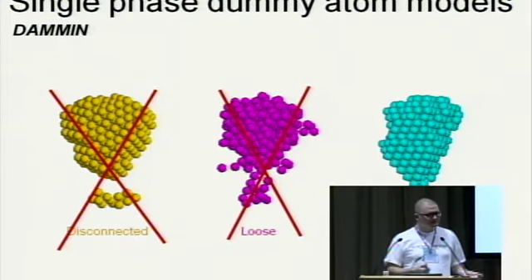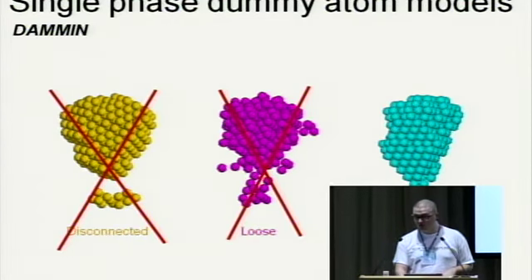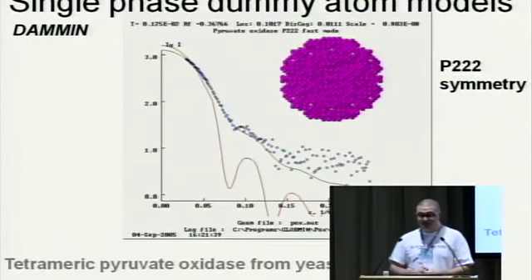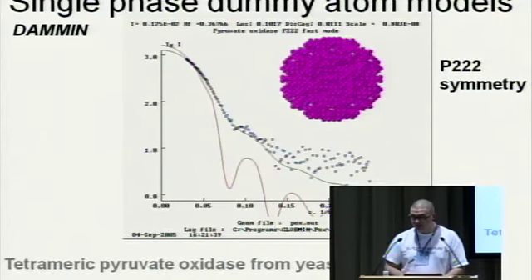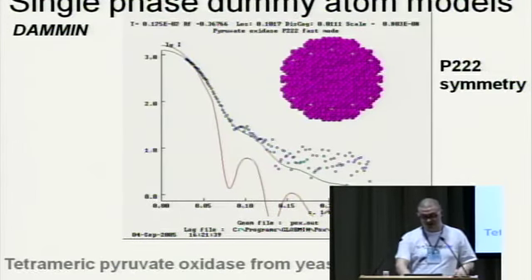And this is already some type of additional information that we can use during ab initio modeling to restrict the results to something that makes sense. Another type of restriction that we can use is symmetry. If we have prior knowledge about the type of symmetries that we have in our, let's say, protein, like in this case, then we can apply the symmetry as an additional restriction.